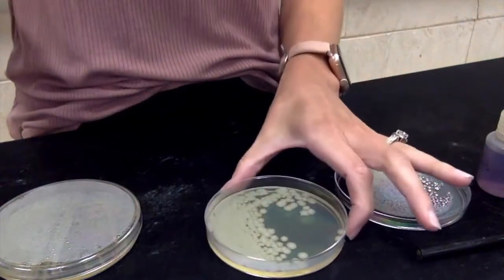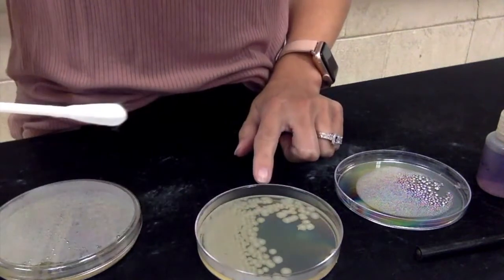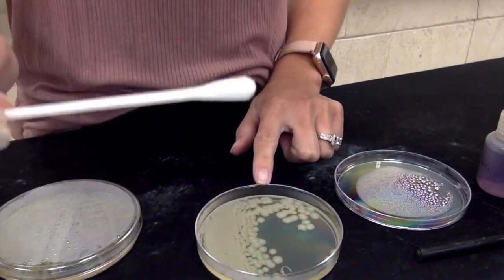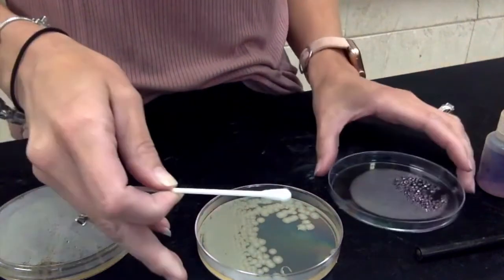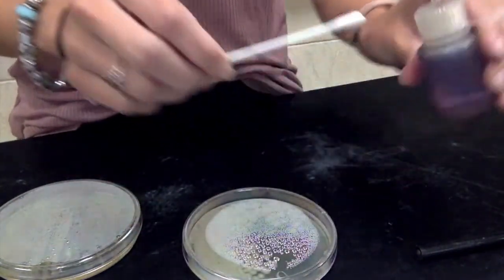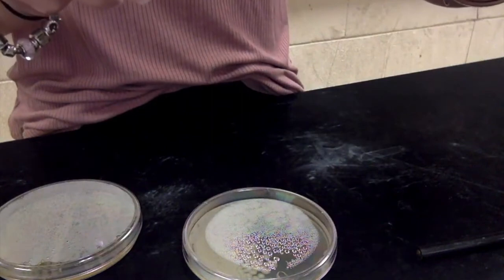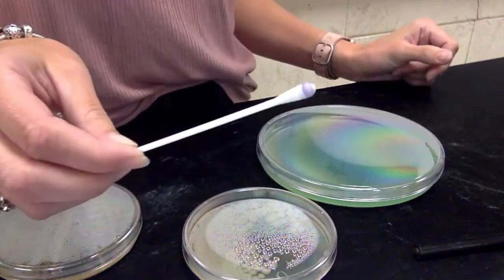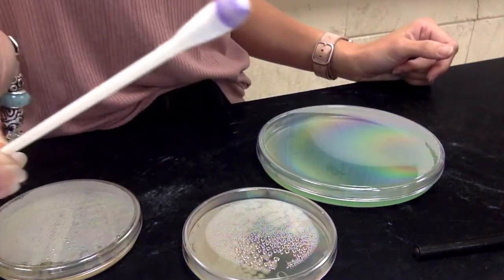Now I'm going to do the same thing, but with my Bacillus. So I got a new sterile cotton swab. Got my colony on my sterile cotton swab. It's kind of hard to see because it blends in with the Q-tip. We're going to give it a couple minutes to change, but you can already see that beautiful purple color that those colonies are turning.